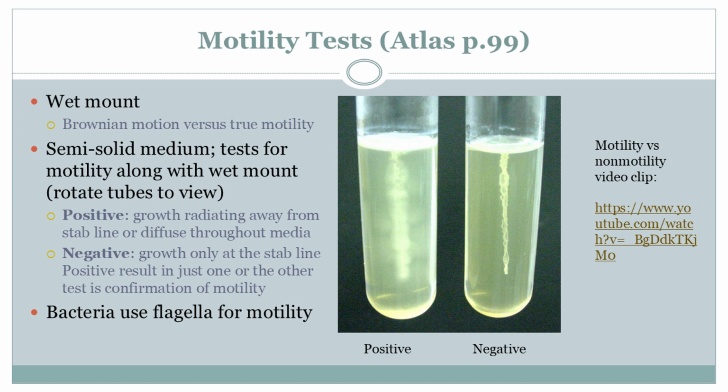Yeah. It's like the wet mount is catching them live in action, and the semi-solid medium is more like checking out the after-party photos. Right. So if both tests tell us if bacteria can move, why use both? Why not just pick one?